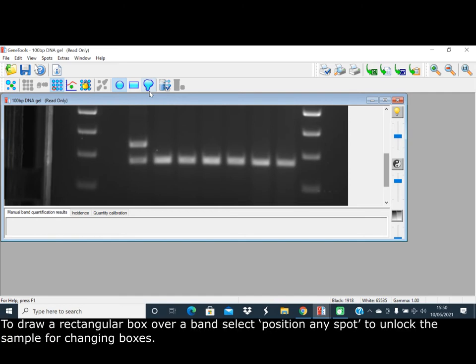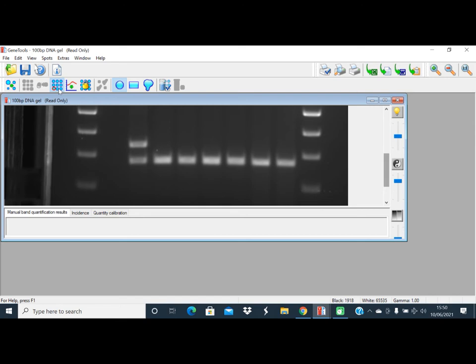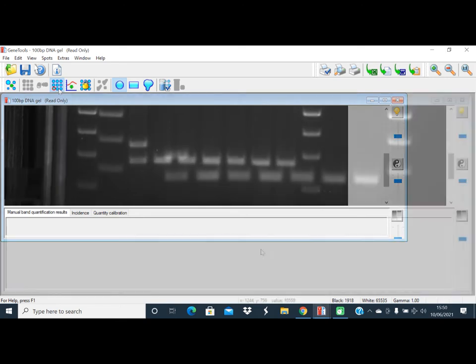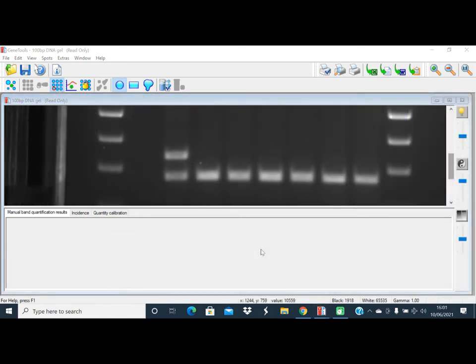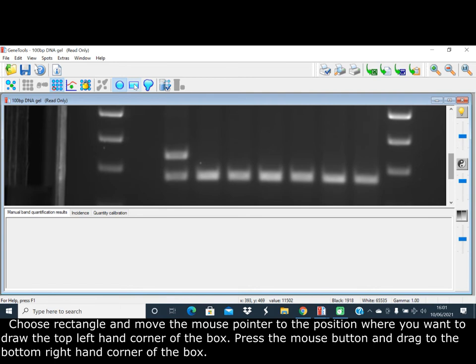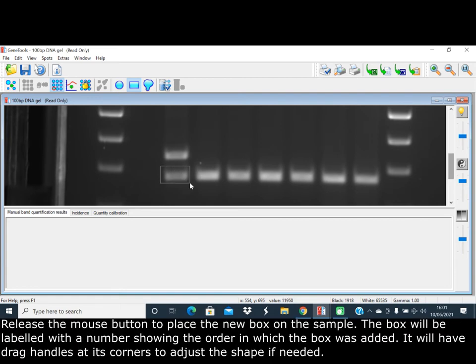To draw a rectangular box over a band, select the position any spot to unlock the sample for changing boxes. Choose rectangle and move the mouse pointer to the position where you want to draw the top left-hand corner of the box. Press the mouse button and drag to the bottom right-hand corner of the box, then release the mouse button to place the new box on the sample.